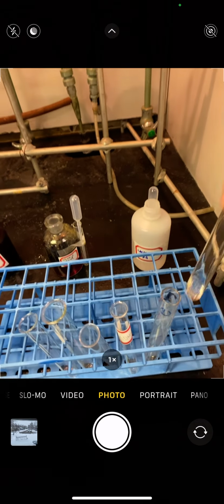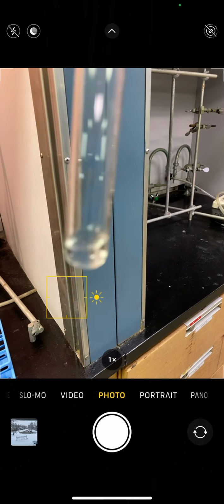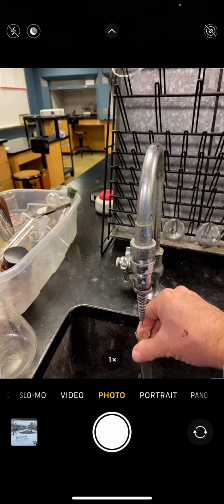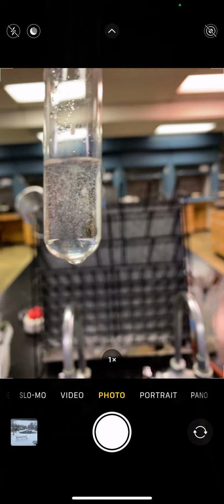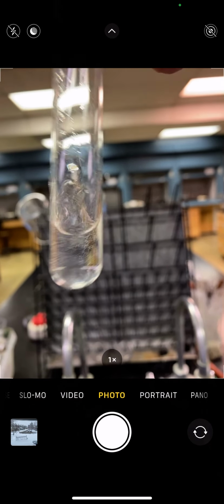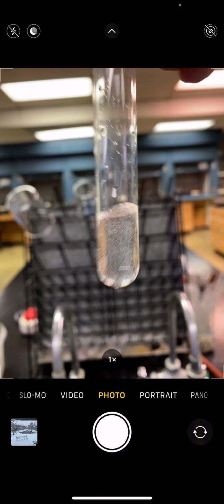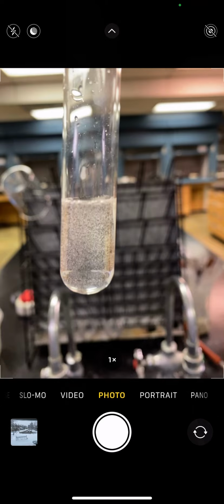And then I'm going to add water. All right, so hopefully you can see that. Looks like 1 layer. Let's add some water. Go to the sink, turn some water on, see if I can catch some of it. And what you should see is, yeah, there's some bubbles there from the chemicals mixing, and it all becomes just 1 layer. It all mixes.